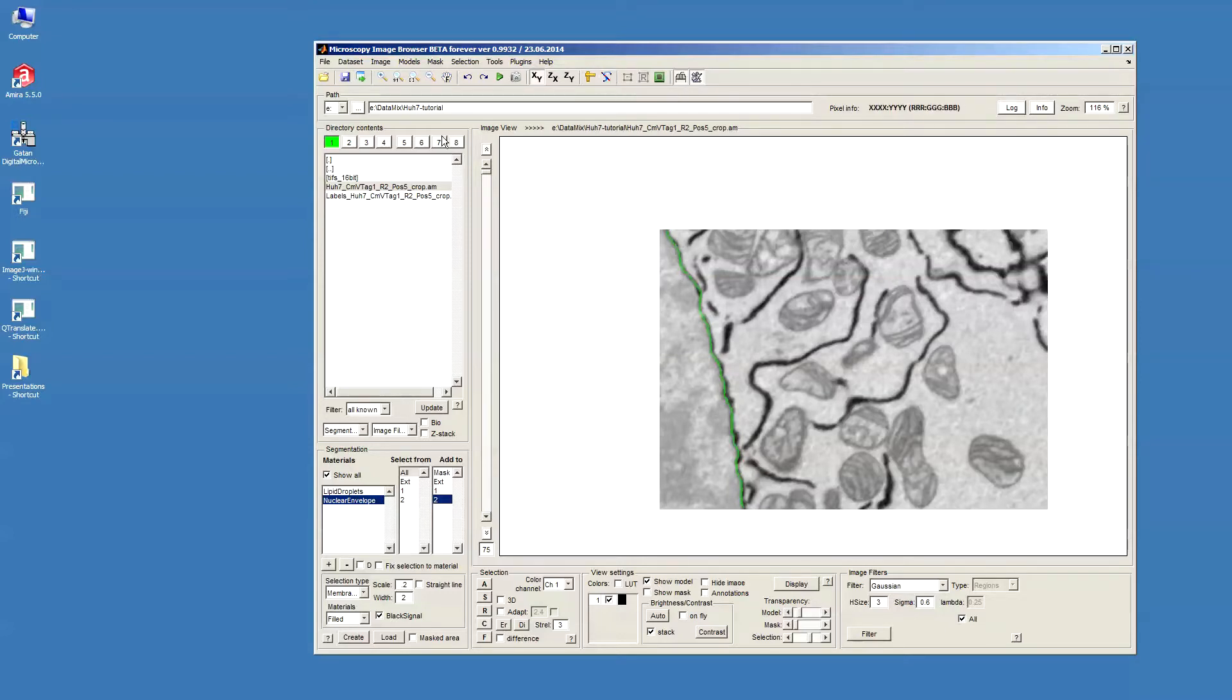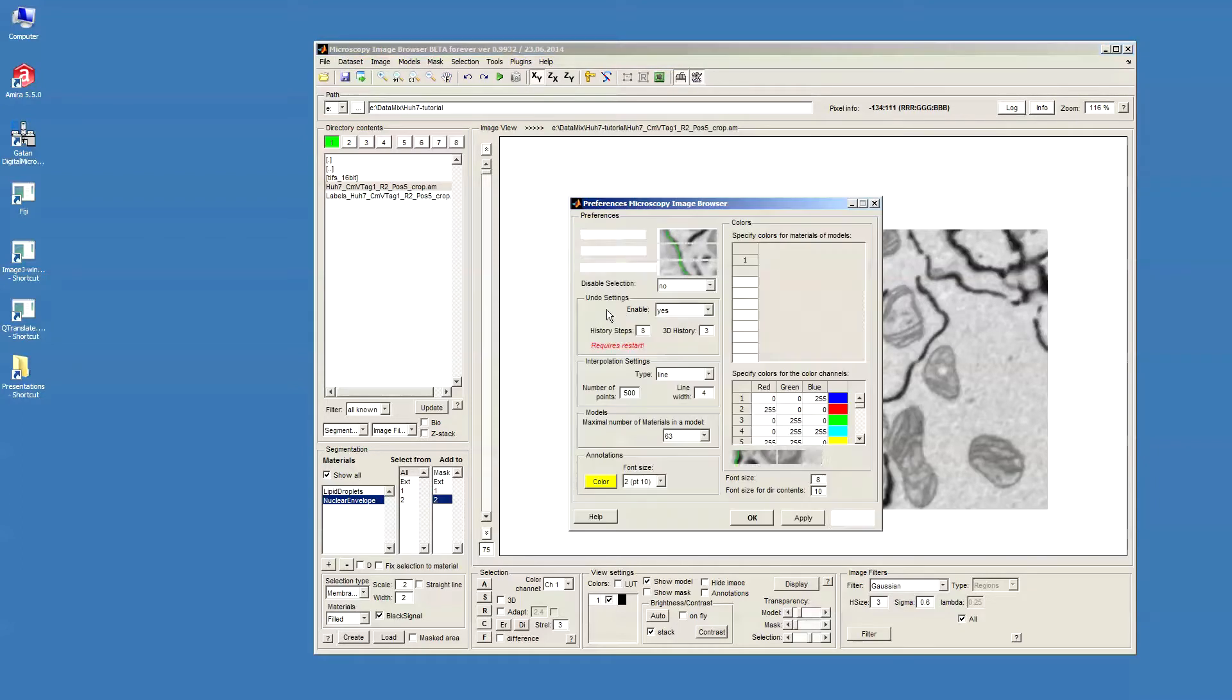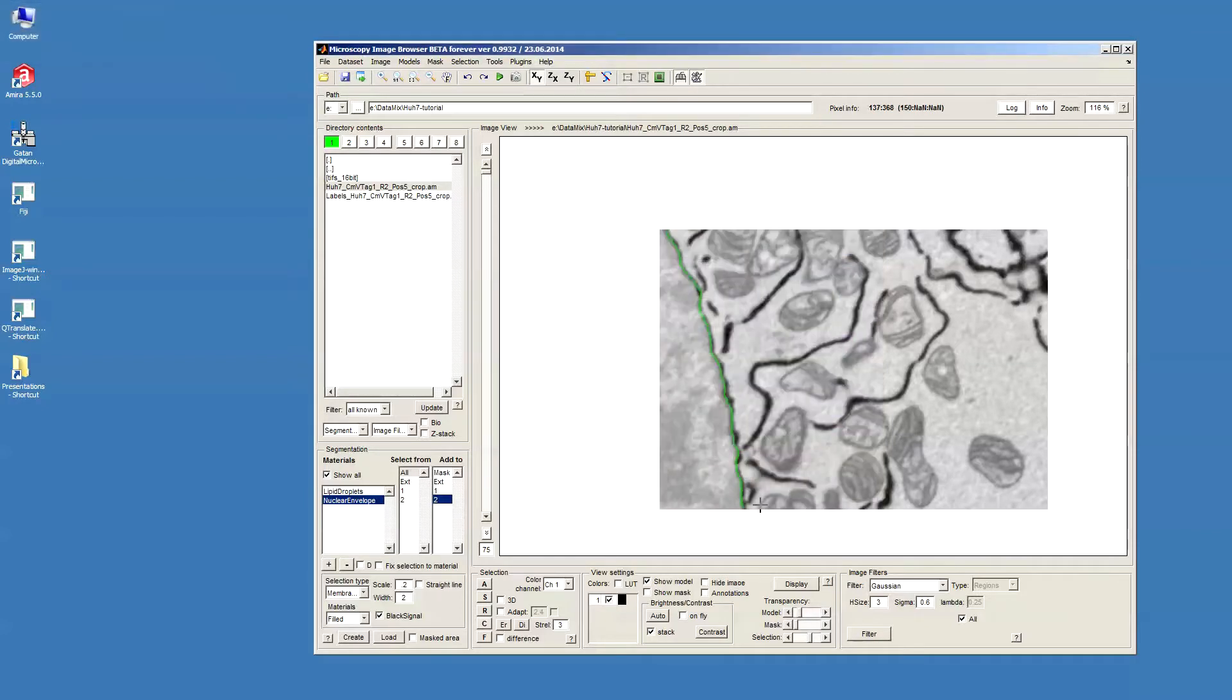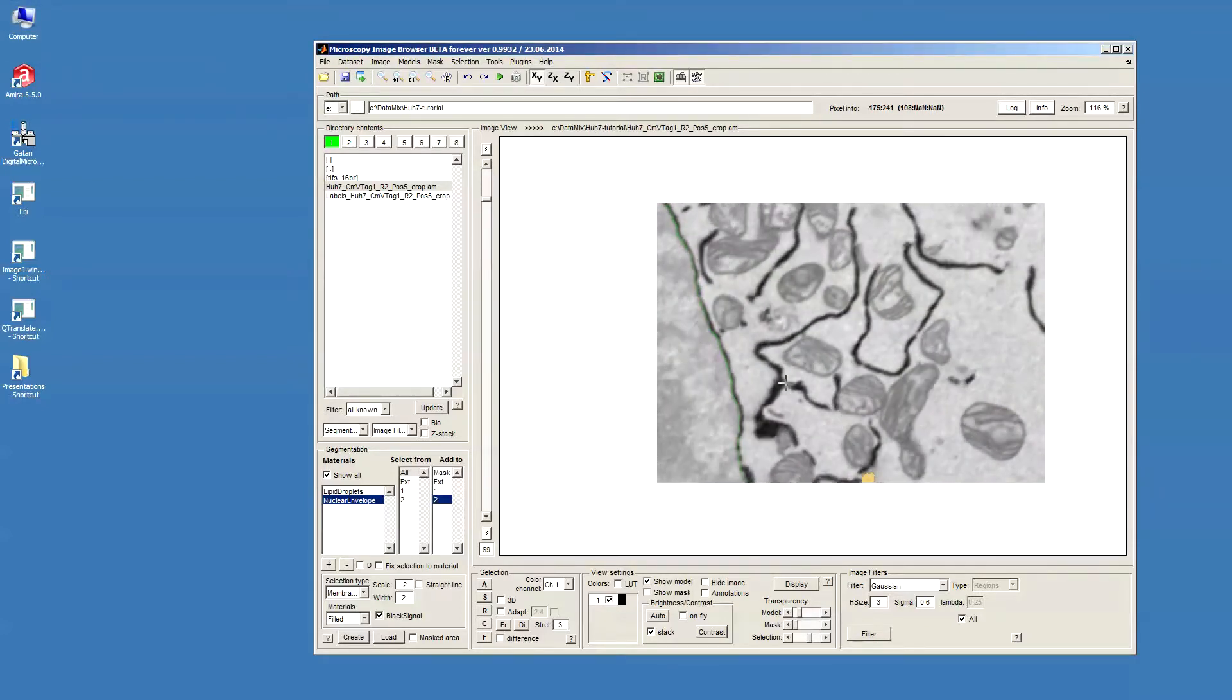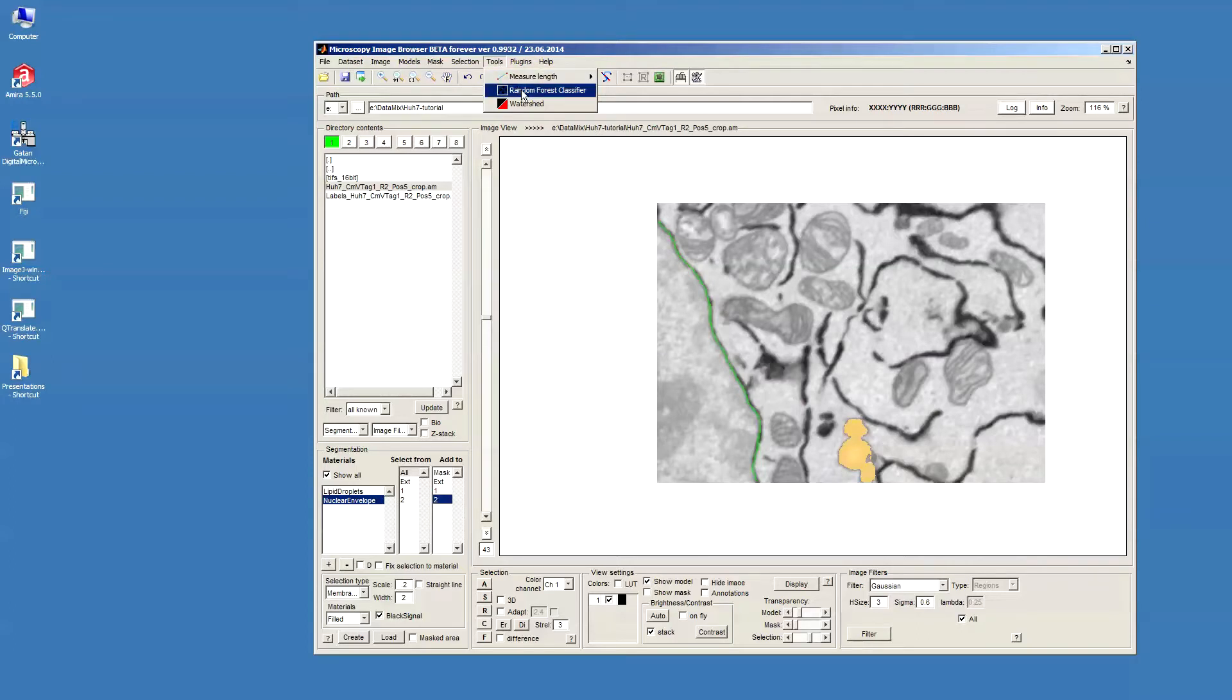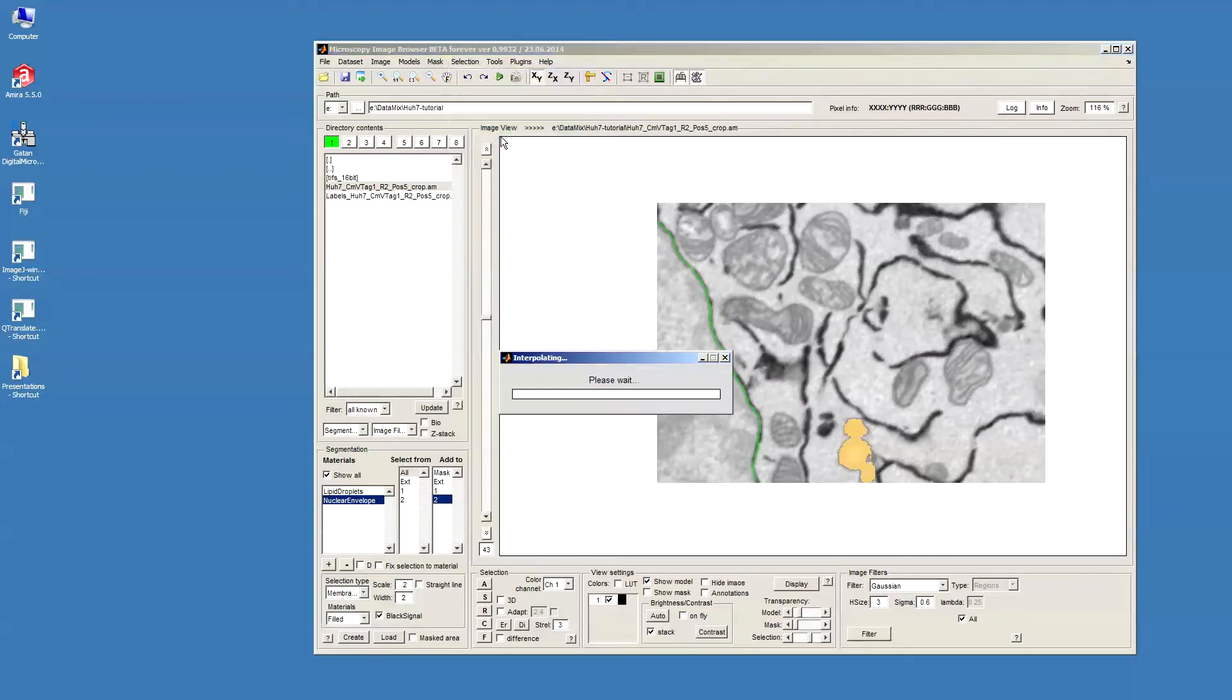The only thing we should check, we just should go in the preferences and then check the width of this line interpolator. Since we use the width of the membrane as two pixels, we should probably place the same number here. Okay, now we have the membrane which is in some slices. And then what we do, we interpolate between the slices using the selection interpolate.